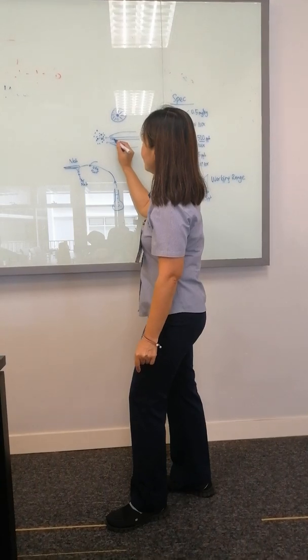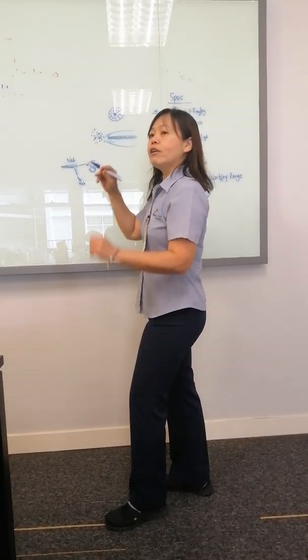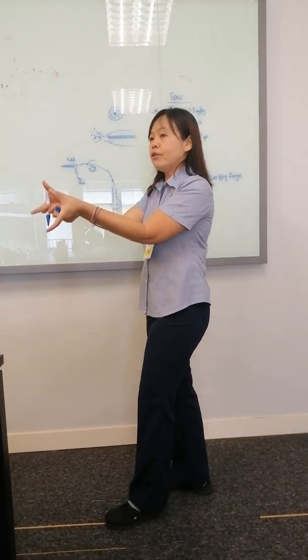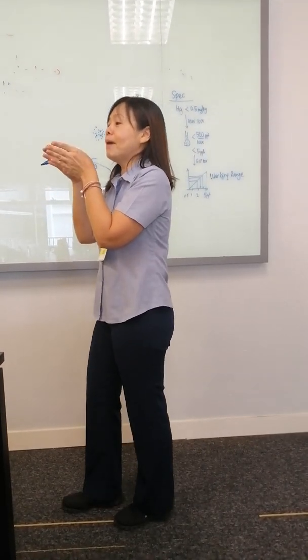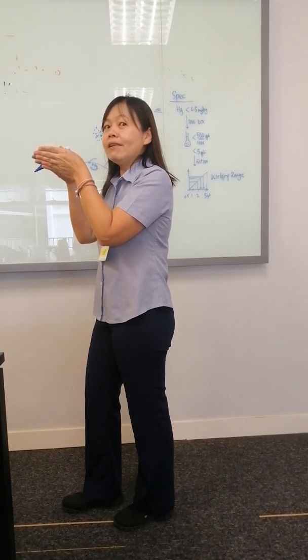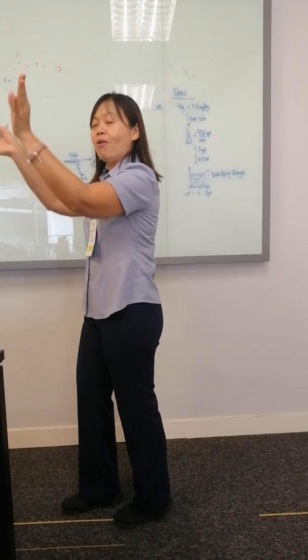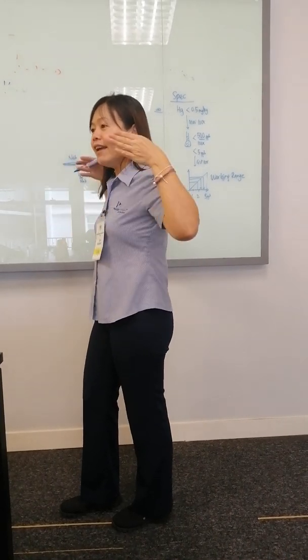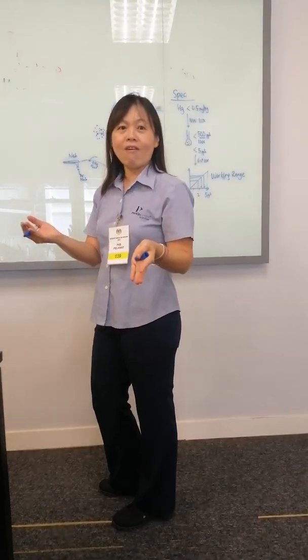So from liquid here, your sample is actually in liquid. Your argon gas is blowing, creating a low pressure zone. When the low pressure zone is being noticed by the sample in the capillary, all the sample says, oh, over there low pressure. So they will all go 360 degrees, hit by the continuous flow of the argon gas, then it becomes aerosol. Okay?